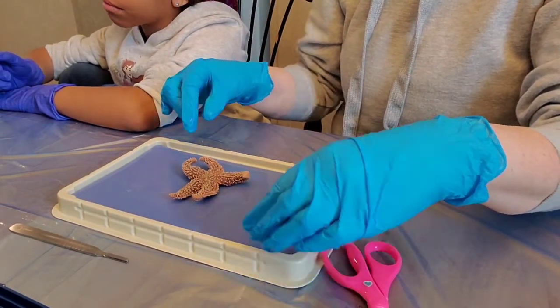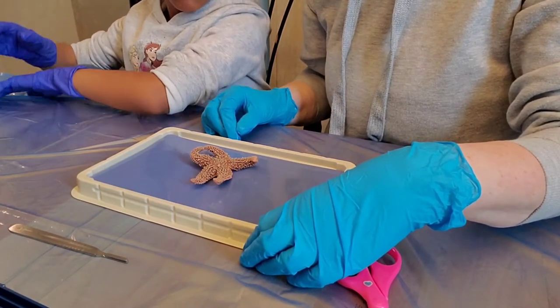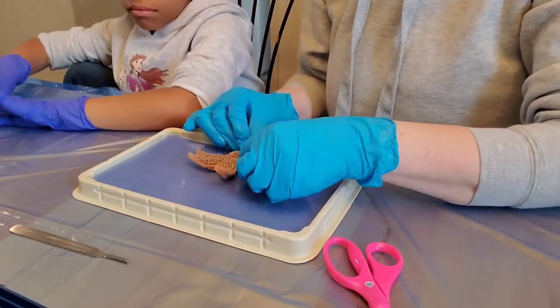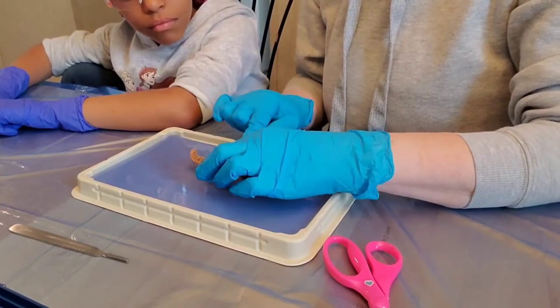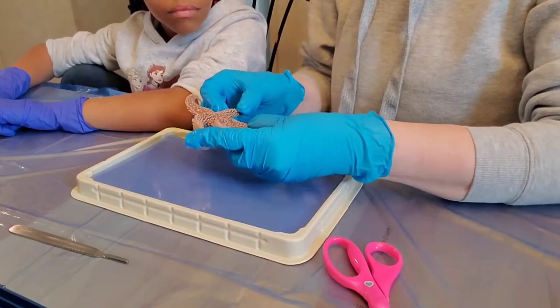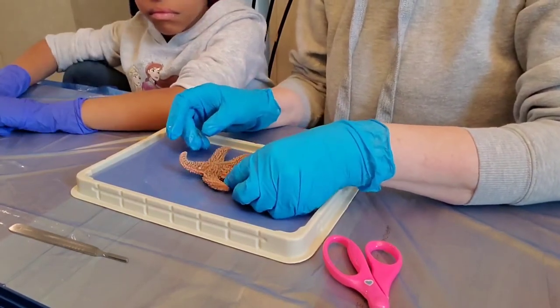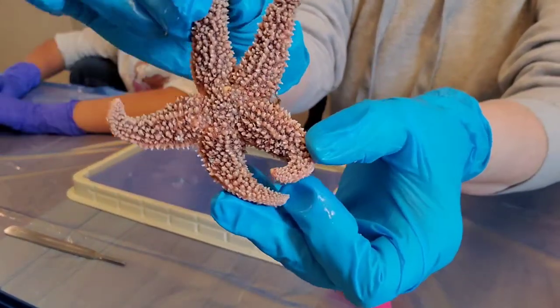With the starfish specimen oriented topside up, look for a tiny circular plate on the surface near the center. This plate is called the madreporite, also known as the sieve plate, and is used to regulate the flow of water through the water vascular system. The water vascular system is used to control the movement of the starfish. Note the rough, spiny surface that covers the body.